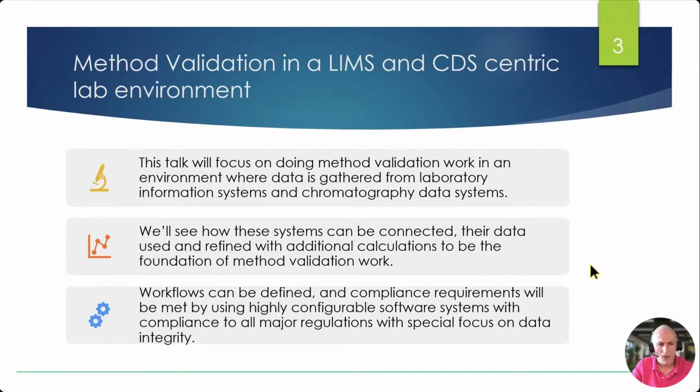This talk will focus on doing method validation work in an environment where data is gathered from laboratory information systems and chromatography data systems. We'll see how these systems can be connected, the data used and refined with additional calculations to be the foundation of method validation work. Workflows can be defined, and compliance requirements will be met by using highly configurable software systems with compliance to all major regulations with special focus on data integrity.